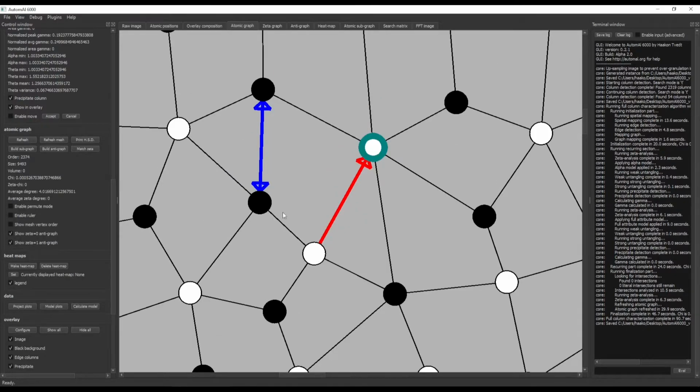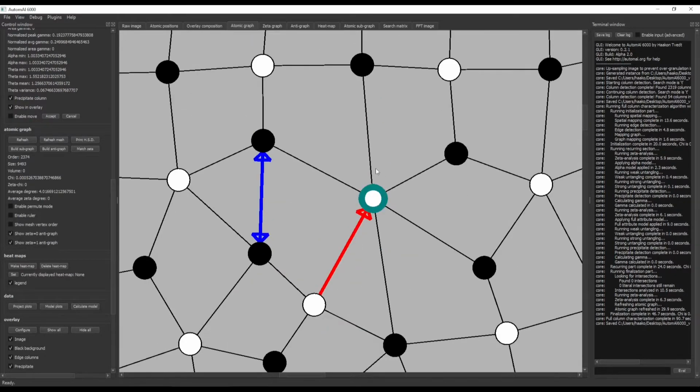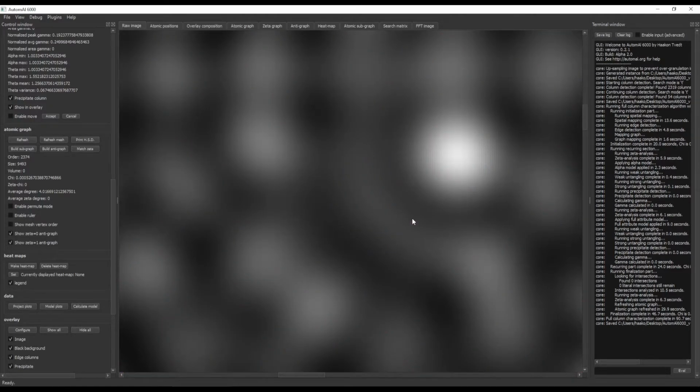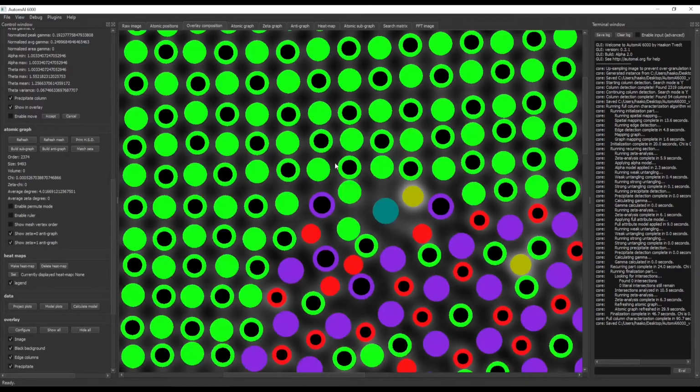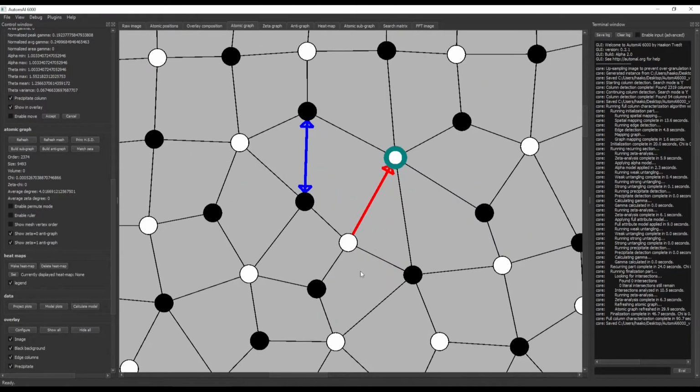So this is again like a 6 opposite plane nearest neighbor magnesium kind of, but if you go back to the actual image, we see that this was the area which is a bit like, I don't know really what is going on here, and this is the situation where your expertise has to fill in the blanks, so to speak. But for now, my guess would be that this is actually silicon, and this one is aluminium, and this is also silicon.